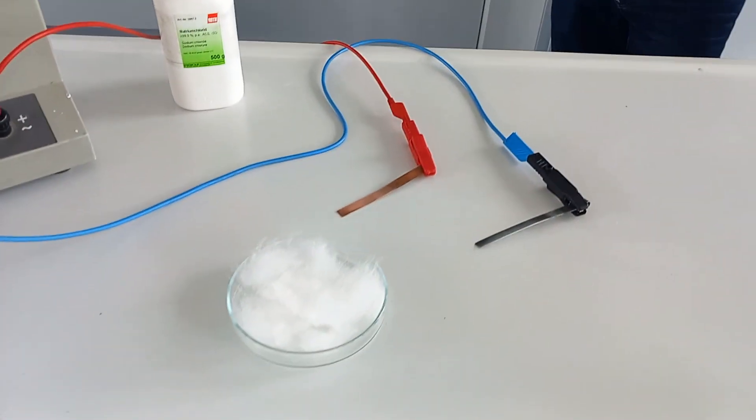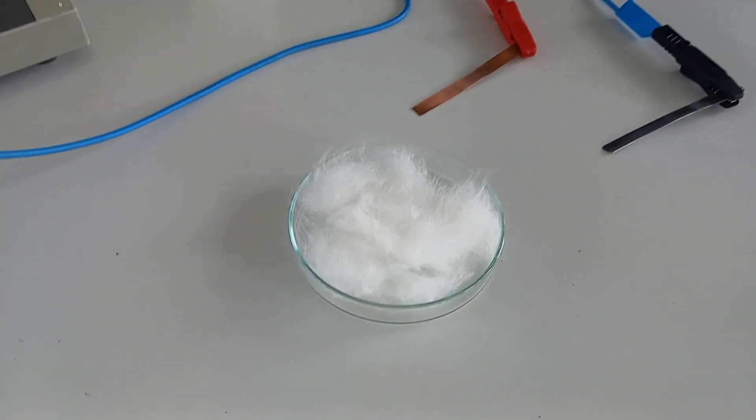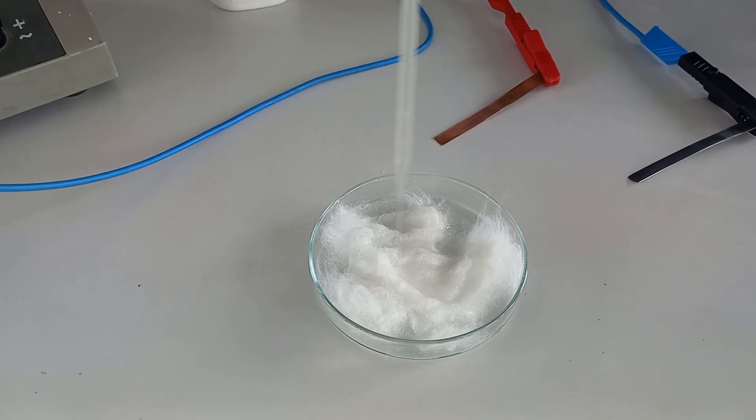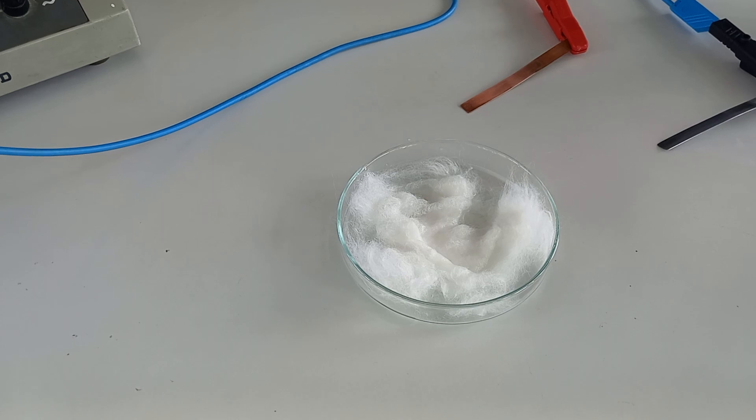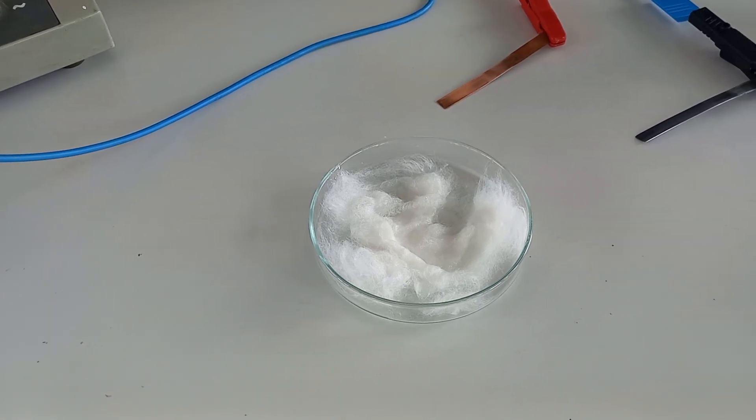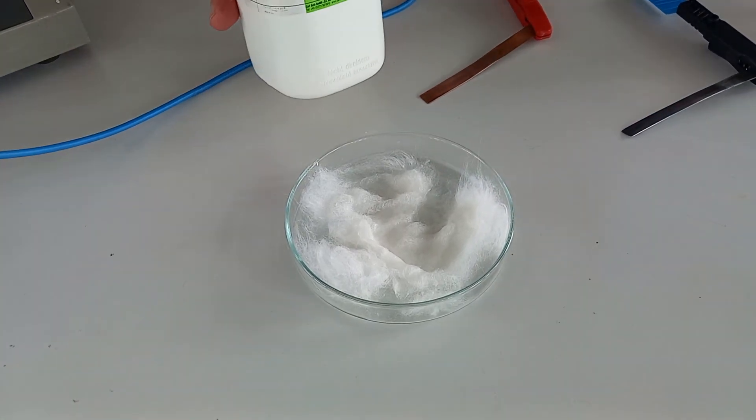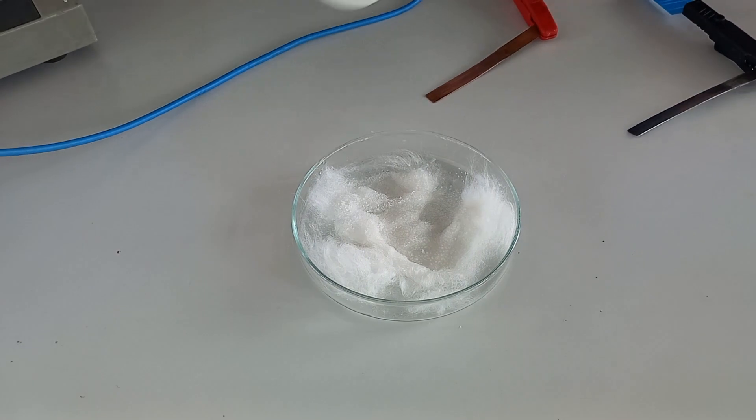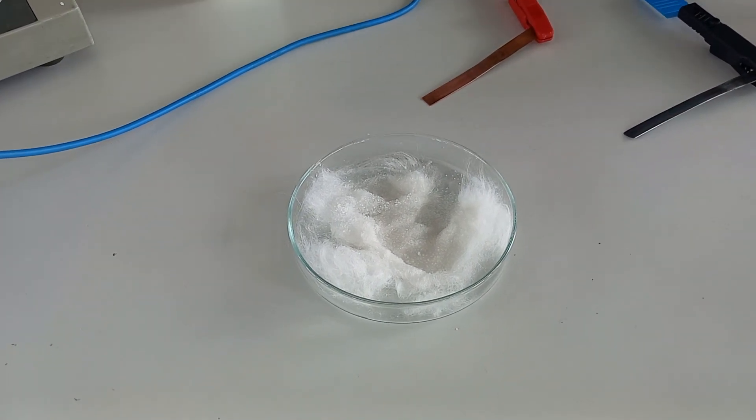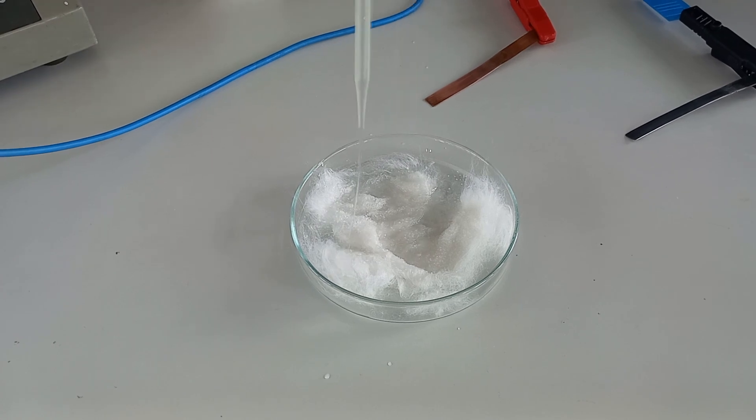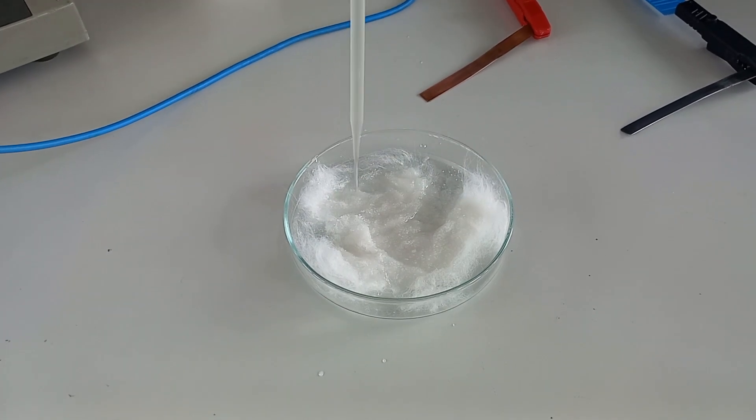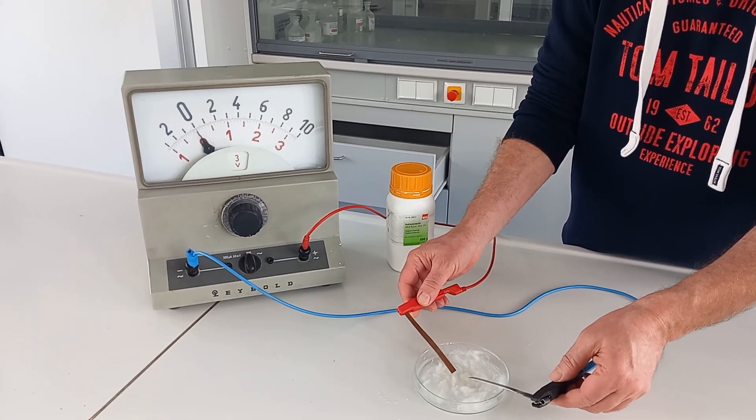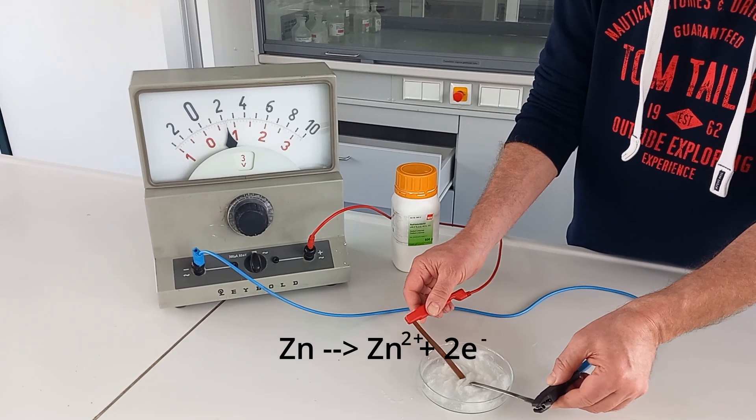The last experiment is a galvanic cell. There is wool in this petri dish. Now we will add salt and water. Now we put in copper and zinc, and as you can see, a voltage is generated.